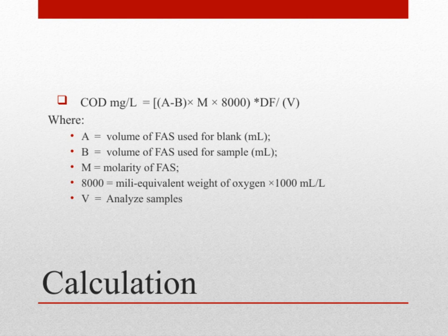This calculation is key because it translates the titration data into a straightforward measurement of chemical oxygen demand. Remember, the core idea is that by measuring how much titrant is used to reach the endpoint, we can determine the amount of oxygen consumed by the sample, which reflects organic pollution levels in water. Connecting this to our overall theme, understanding and accurately calculating COD helps us assess water quality efficiently, guiding environmental management and treatment processes.